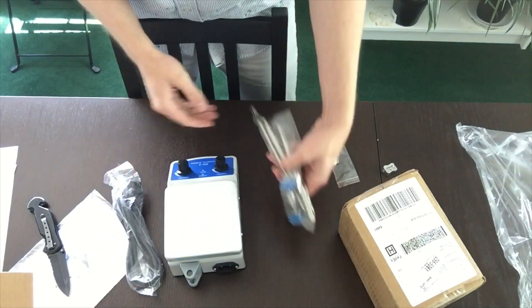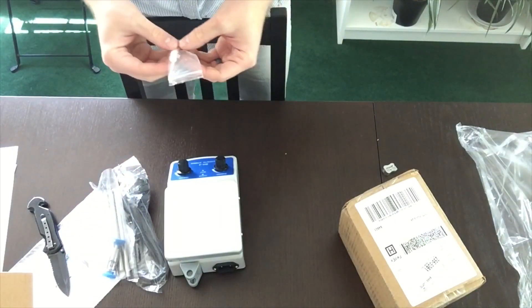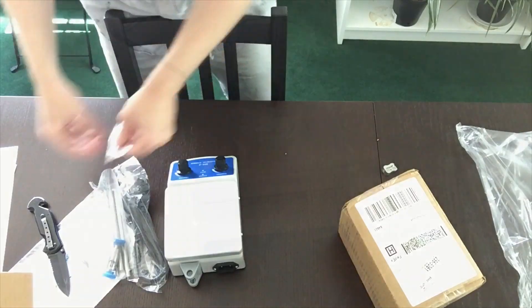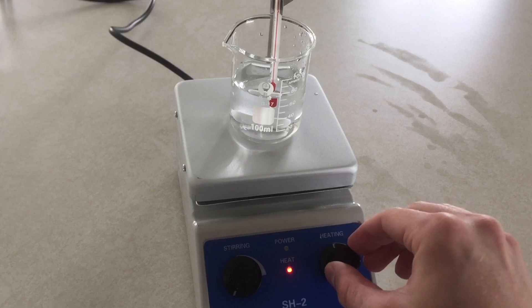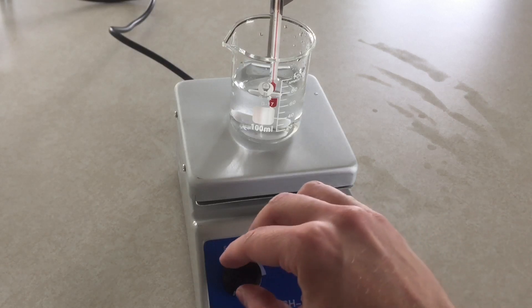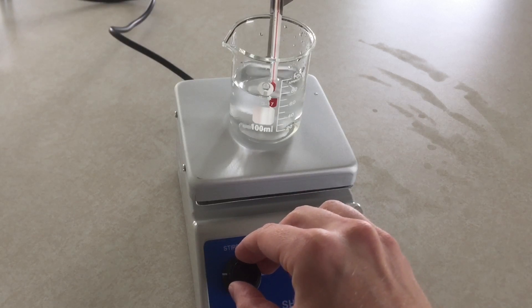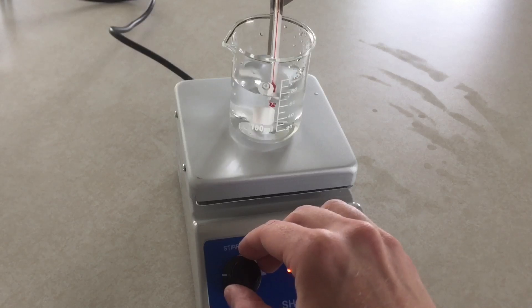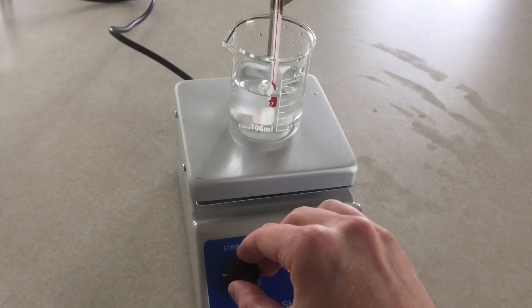It's nice that it came with a magnetic stirring bar even though those are super cheap. It allowed me to test the stirring feature to make sure that works. I decided to just boil some water. I also have a thermometer that I recently purchased for dirt cheap off eBay, and I've only used the beaker for mixing oils for perfumes. Here you can see that the stirring element works, which is convenient.